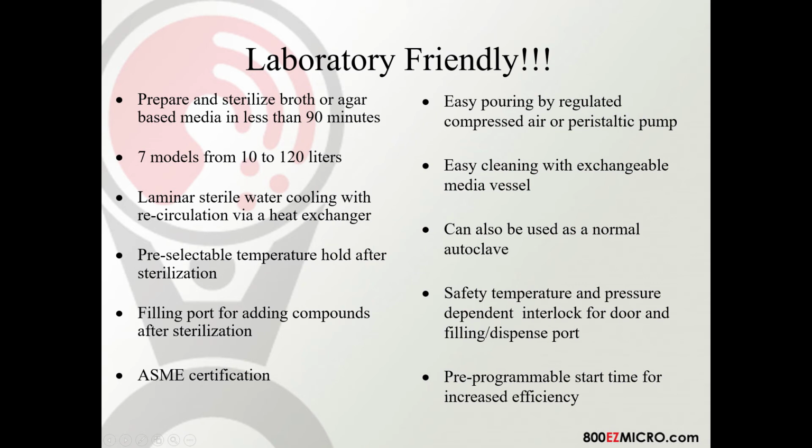So the high points for the MediaPrep systems: we can prepare and sterilize broth or agar-based media in roughly 90 minutes. Once we get to the 120-liter system, it's going to be a bit longer, simply because of the sheer volume of the instruments. 7 models from 10 to 120 liters. We have laminar sterile cool water cooling via heat exchanger. So the tap water inside of this instrument never touches any of the demineralized water as it runs through that heat exchanger. We have pre-selectable temperature holds after sterilization, ports for adding components.